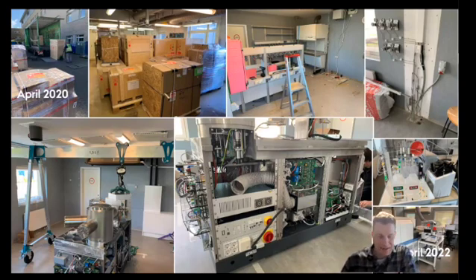Then, as Rune mentioned, the Corona lockdown came shortly after, and we received the instrument, 2.5 tons of equipment in 11 very large boxes, filling the entire workshop in the basement. However, despite the lockdown, we were able to slowly start to build up a new laboratory to house the instrument, with many challenges and delays, especially due to Corona work and travel restrictions at the time. In total, I think the technicians probably spent a month over numerous visits to install and set up the instrument. And then finally, two years after, in April last year, we were able to run the first Mercury isotope measurements. In that regard, I'm also grateful to Jeroen for pointing me in the right direction on the method part, which has probably saved me quite a lot of headaches.